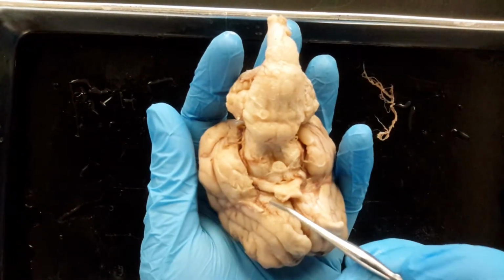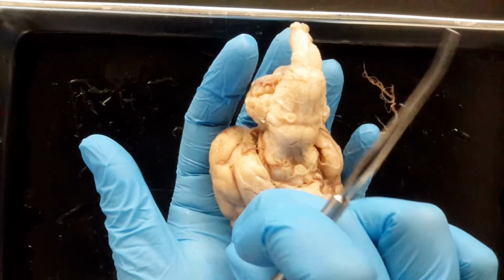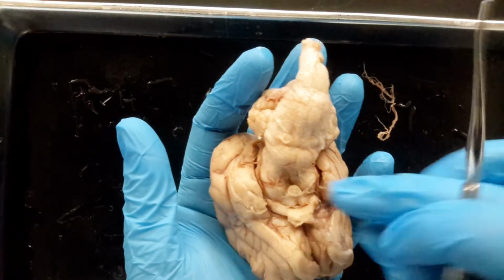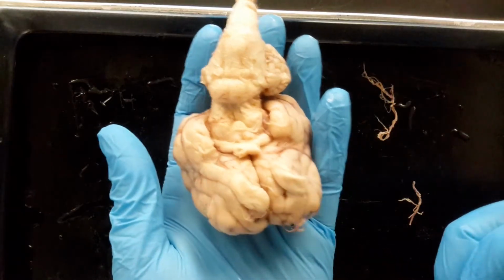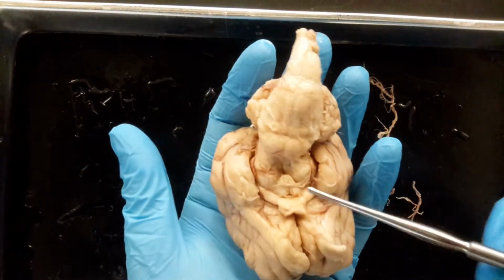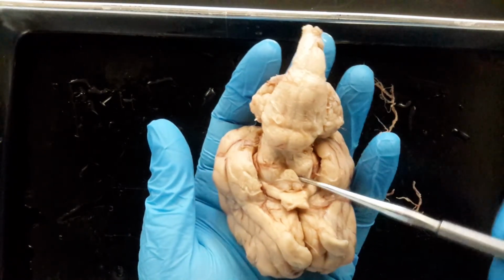Okay, the brain is really delicate, and some of these, for some reason, are very mushy. So we want to be careful. If you can get a blood vessel up, that means you're underneath the pia mater. Okay, so you want to clean the inferior portion to see some structures better.